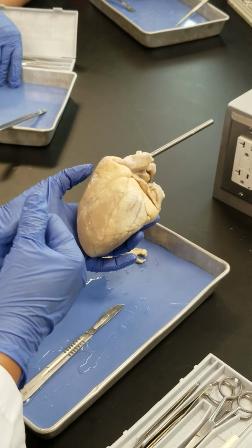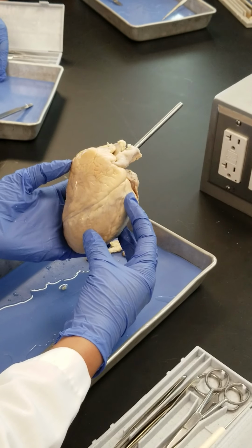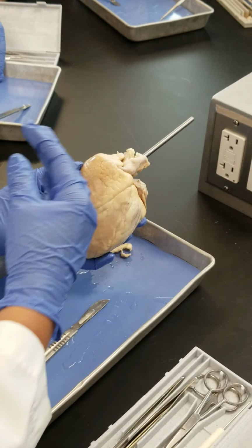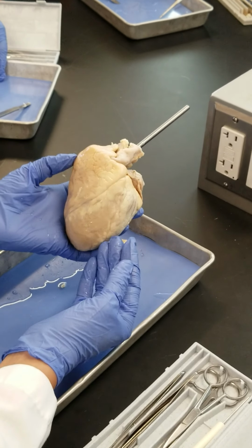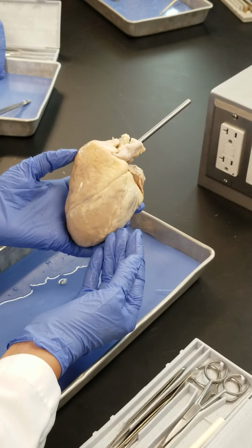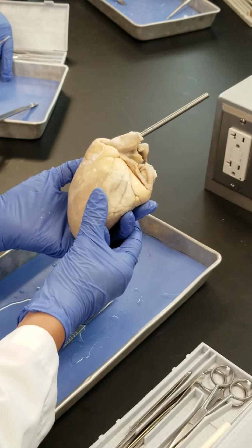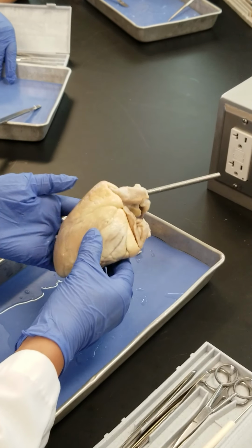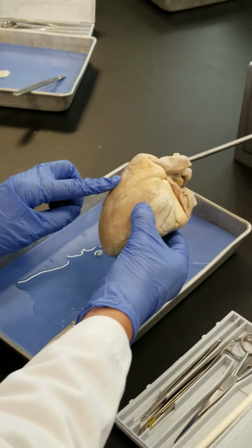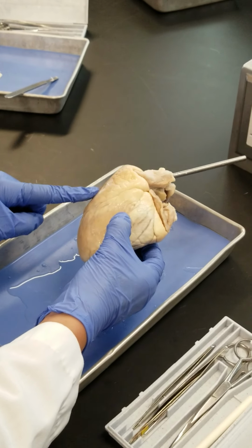You remember, the human heart is slightly located like this in the body. So most of the anterior is mostly right ventricle, and from the left ventricle you see only a bit of that. The rest of that is on the posterior. But you see, the sheep heart is a little bit different, but still it has all the parts similar, right? So that is the right ventricle, and this vessel is coming out of that. Which vessel should it be?